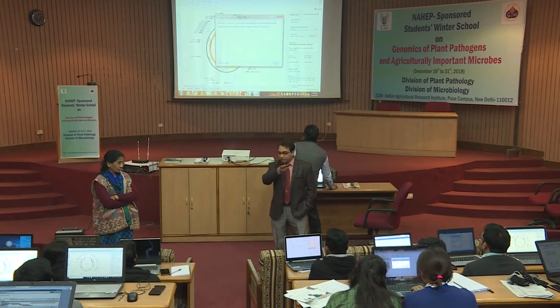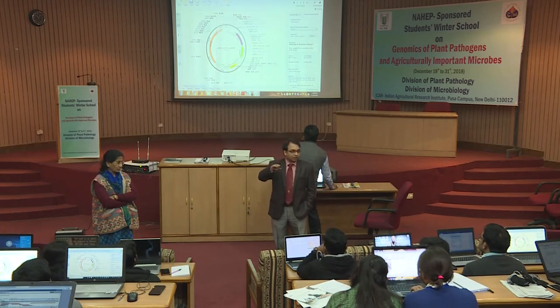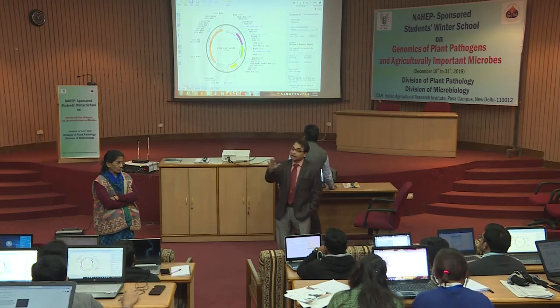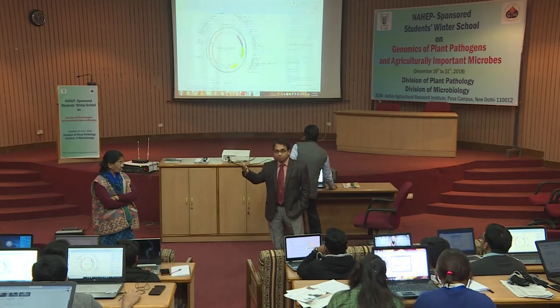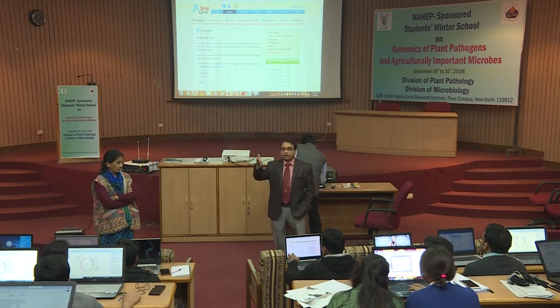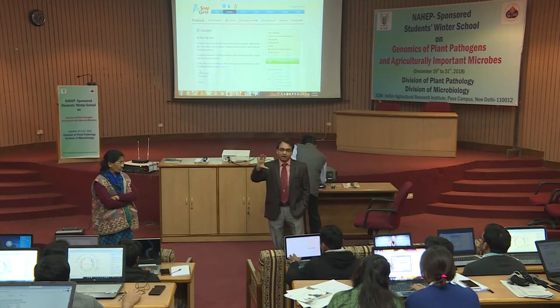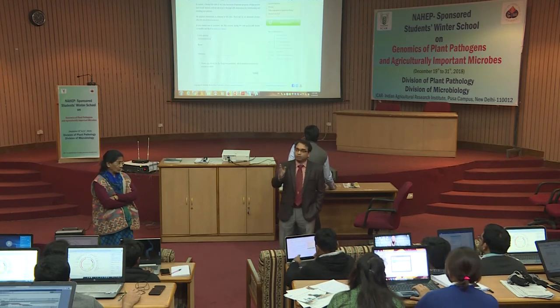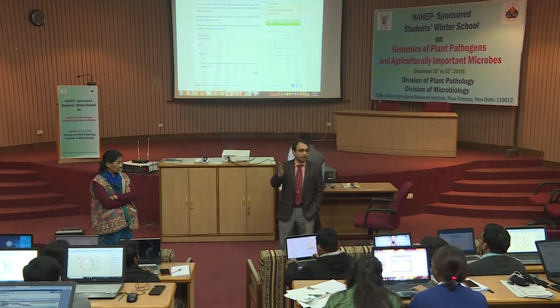So they will scan the sequence, and if they find those kinds of sequences, they predict that this could be an ORF. Another software may use some other more or fewer queries, and accordingly they have a kind of base file already incorporated into the software. The software will match with that base file, and only if they find a match will they give you the sequence.